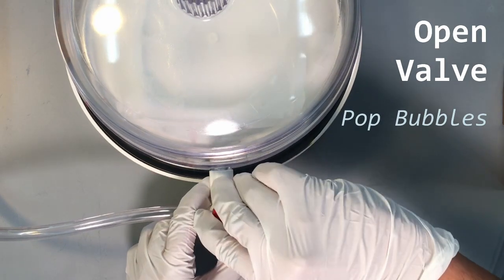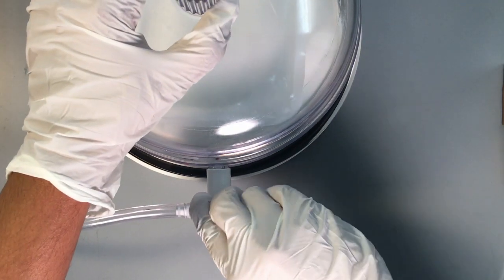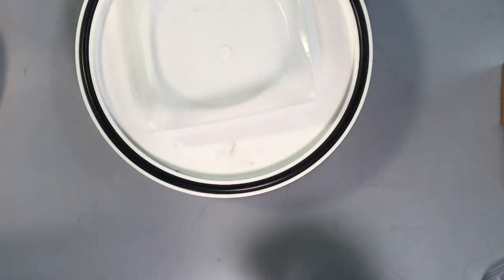After 5 minutes, open and close the valve suddenly to pop the bubbles in the mixture. Repeat this until all bubbles have popped. Release pressure in the desiccator and remove your weighing tray. Check for any remaining bubbles.